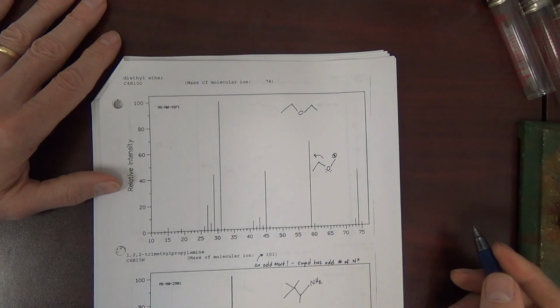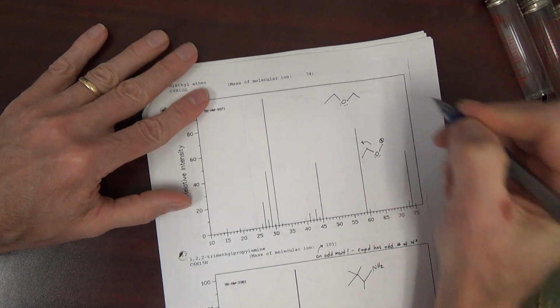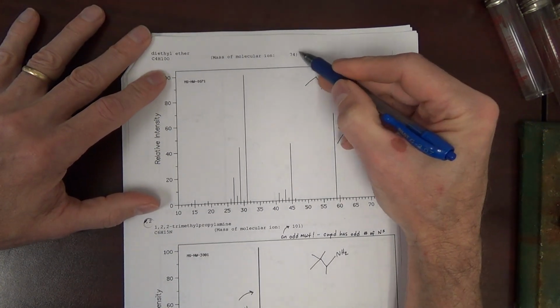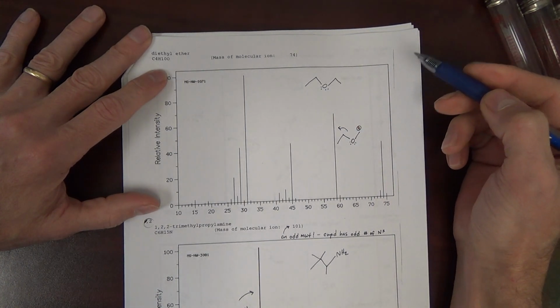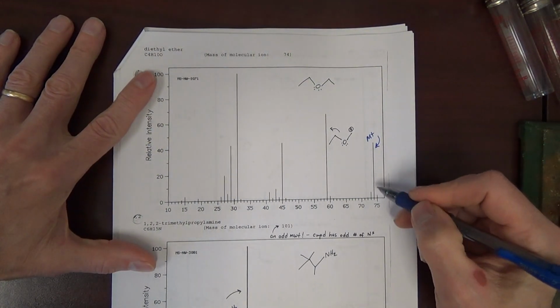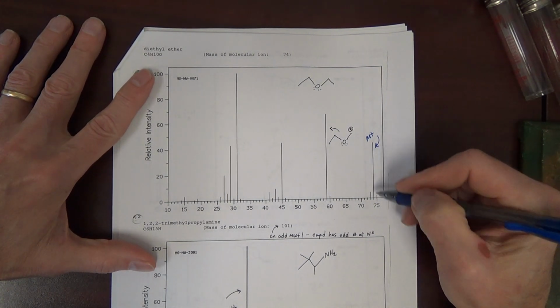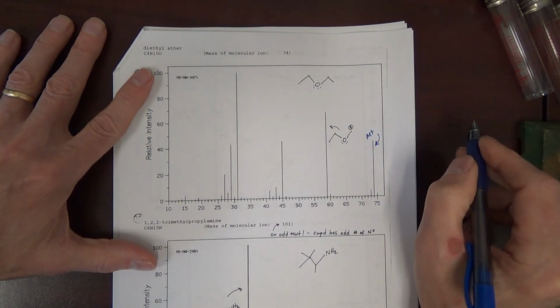Let's look here at another compound. Now this is an ether. Molecular weight is 74. That's a nominal mass. We're not considering any carbon isotopes. Do we have a 74? Yes. So we have our M+, molecular ion that survived long enough to hit the detector and registered a peak. The rest would be fragments of this.